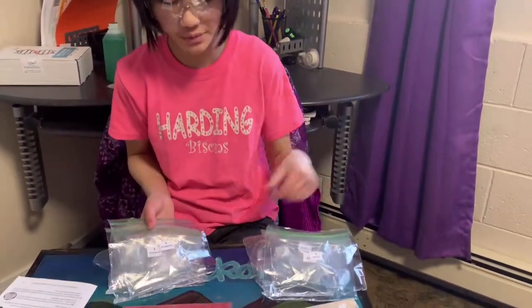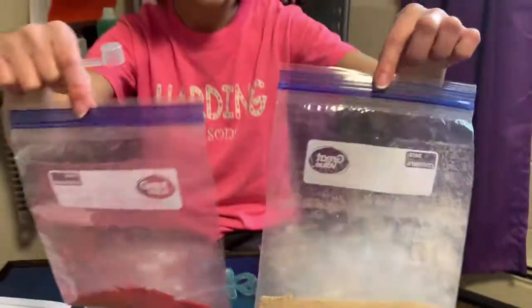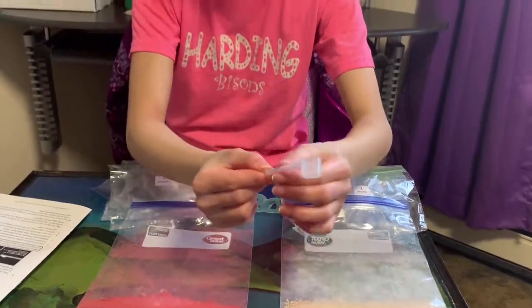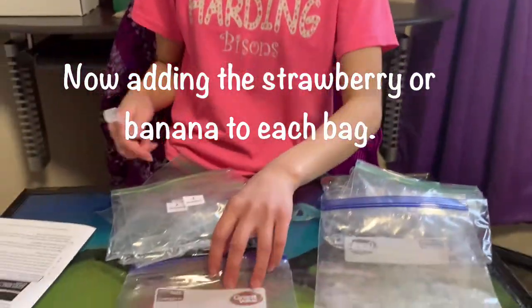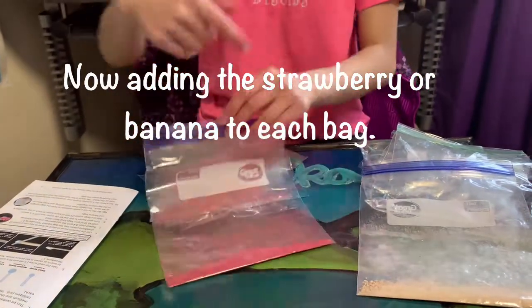Okay, so now we're going to put our banana and strawberry into the bags with a medium scoop. So the other one was 15 milliliters, and this medium scoop is 2.5 milliliters, so it's smaller. So let's start with strawberry number one, and we're going to put all these in here. And the banana's in there.